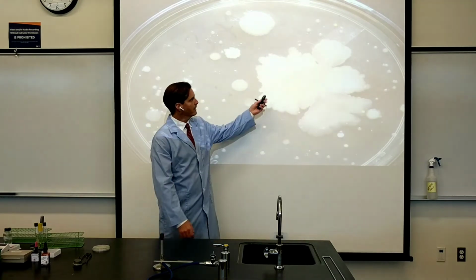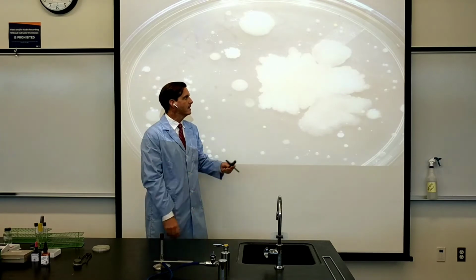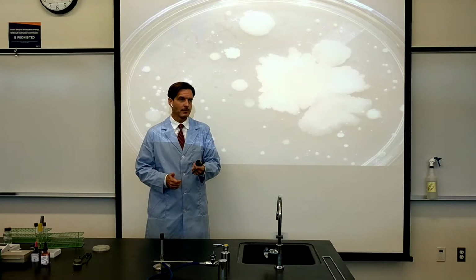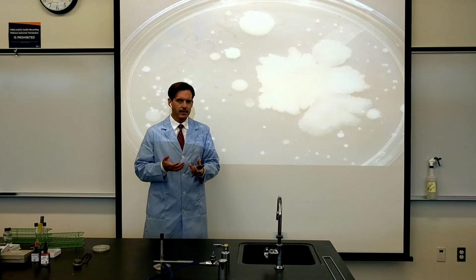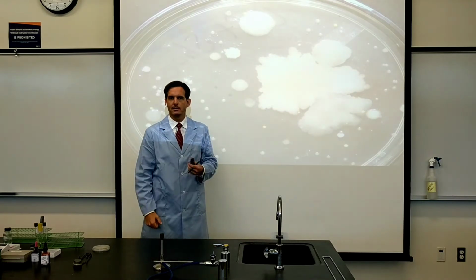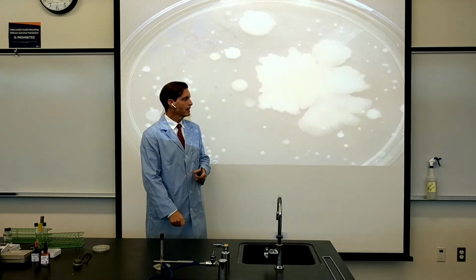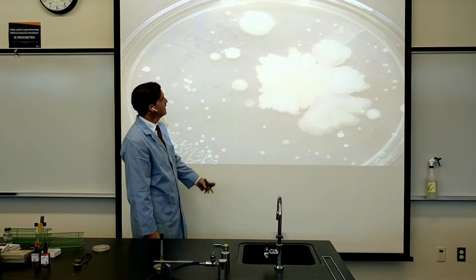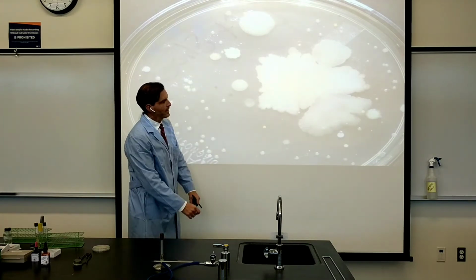Bacillus species typically are rough and dull looking. Bacillus anthracis can be most readily identified by growing these cloudy, rough looking colonies on blood agar. And when you grow them on blood agar, they actually look like fried eggs that can peel up at the edges of a fried egg, like it's in a pan, but it's on blood agar. And if the edges lift off and it has a fried egg appearance, it could very well be a deadly organism like Bacillus anthracis. So again, I'm being very careful, but I wanted to at least take a look and see about all these different organisms.